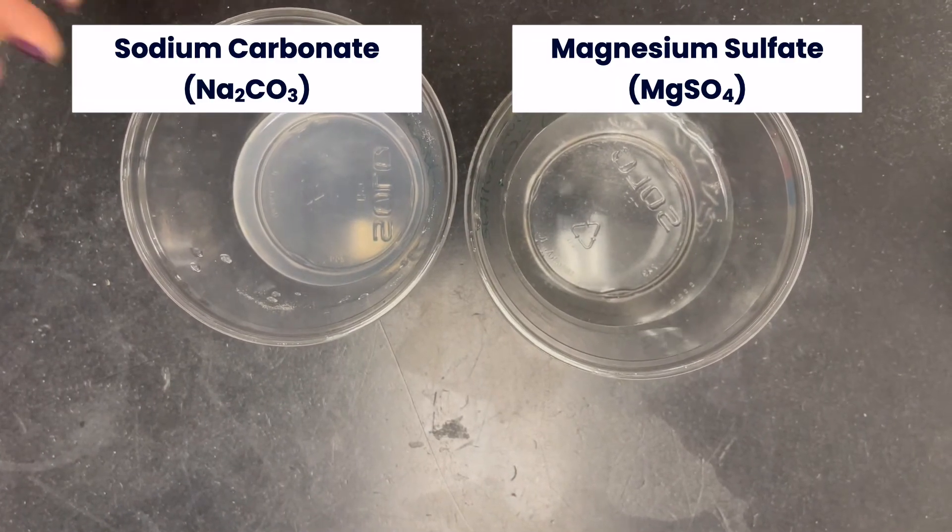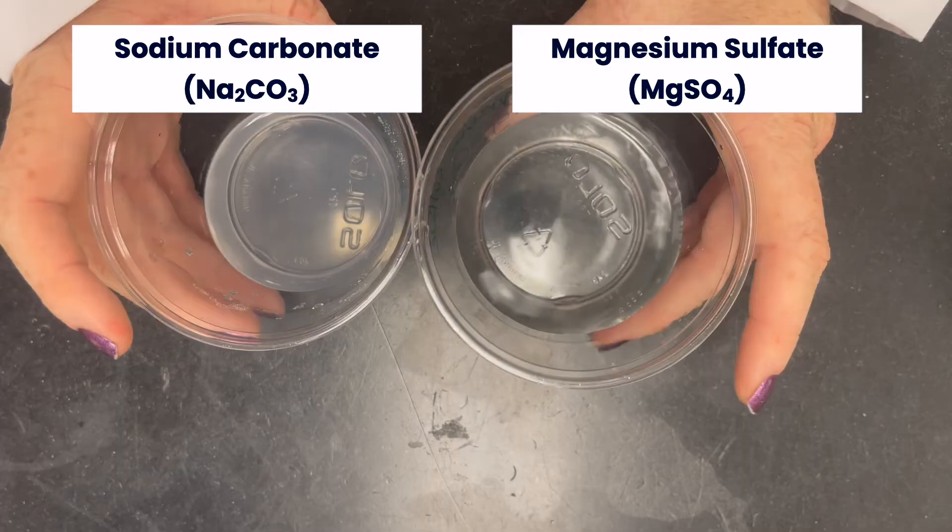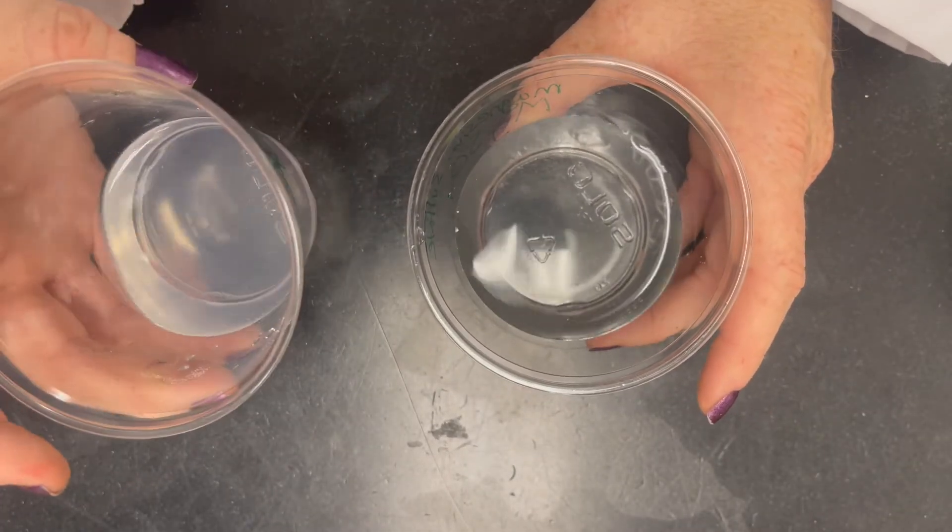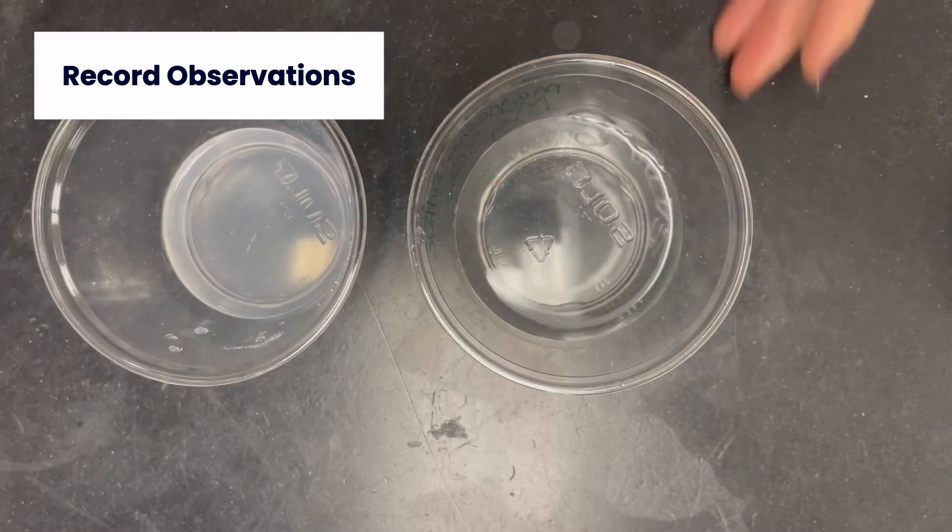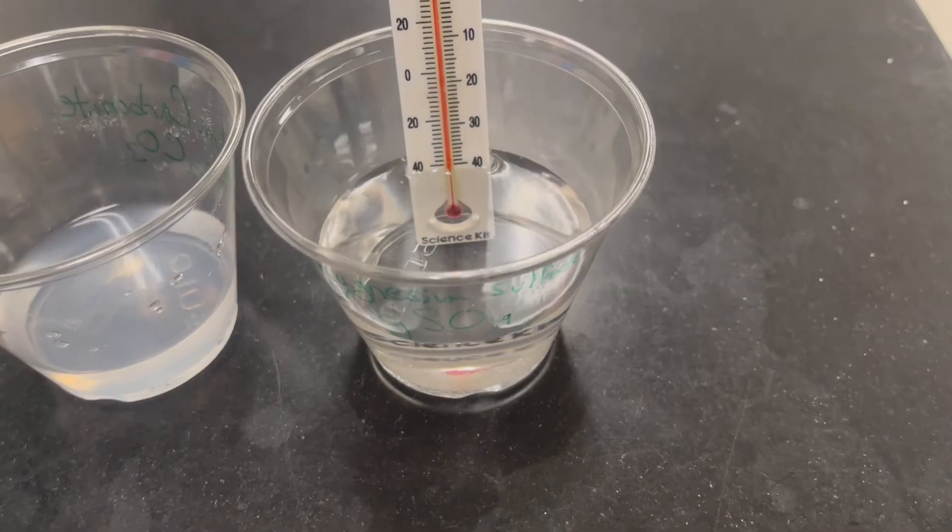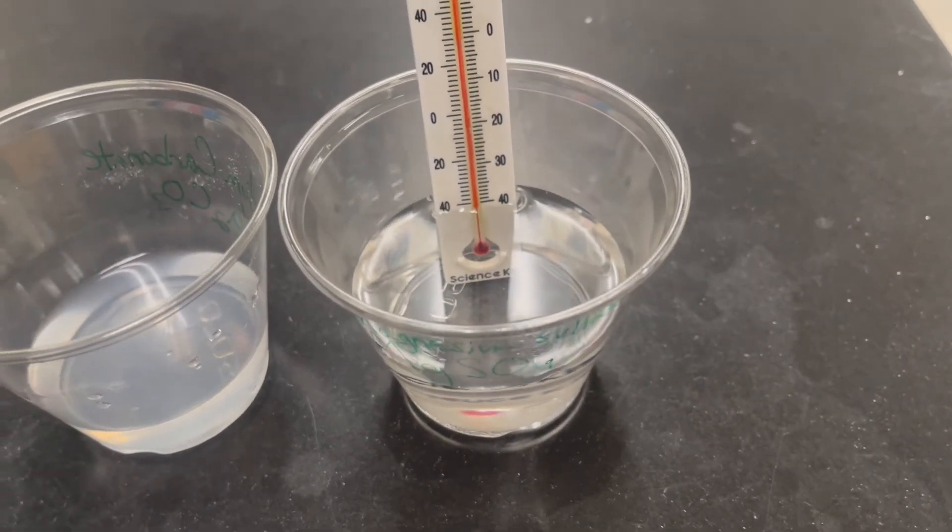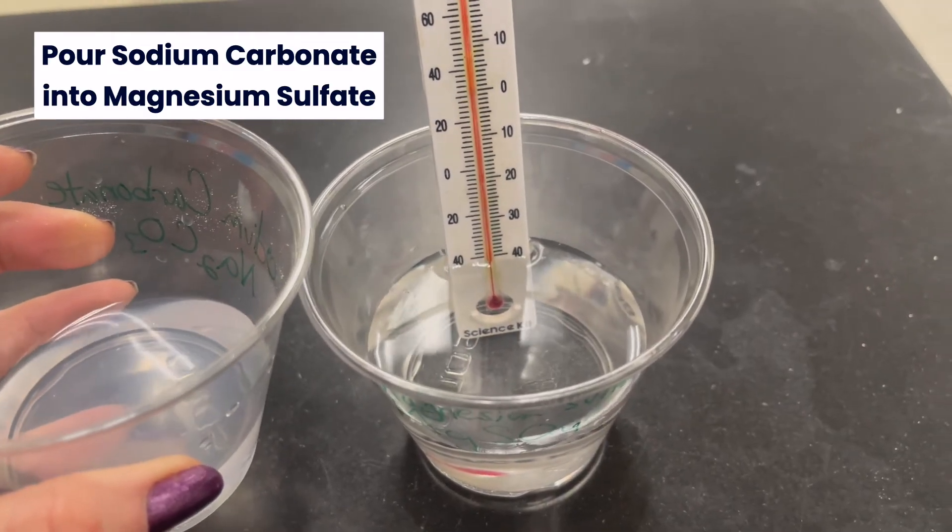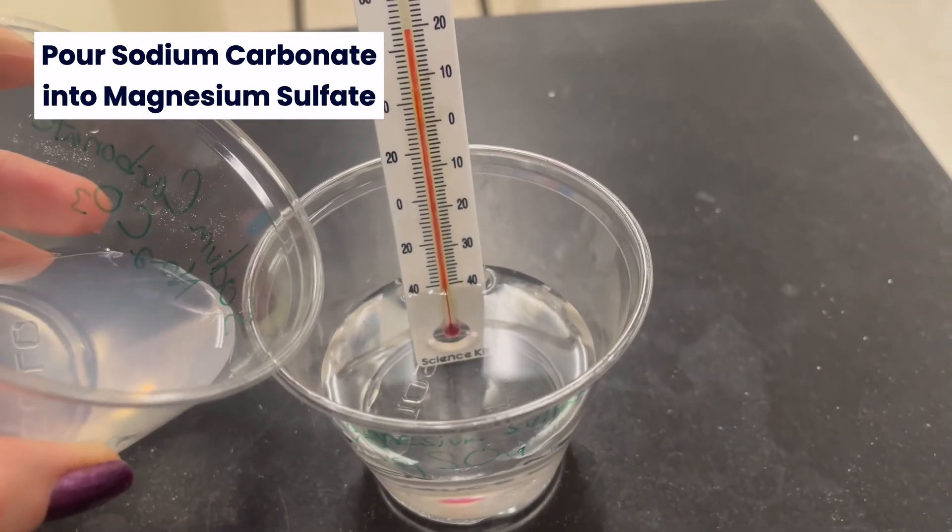So now we have Sodium Carbonate and Magnesium Sulfate in solution form. Record some observations. Then pour the Sodium Carbonate into the Magnesium Sulfate.